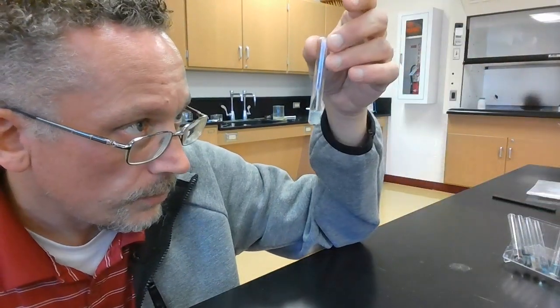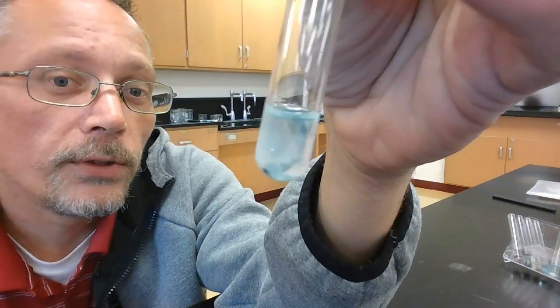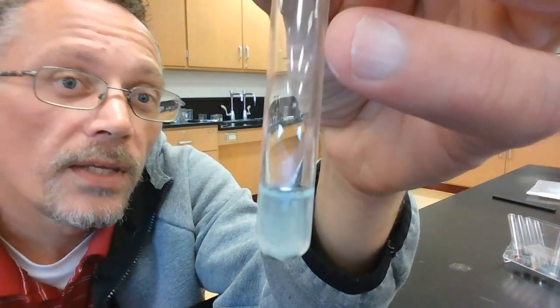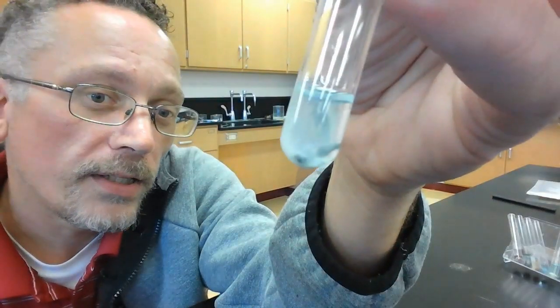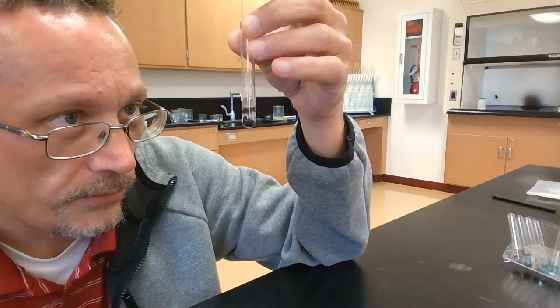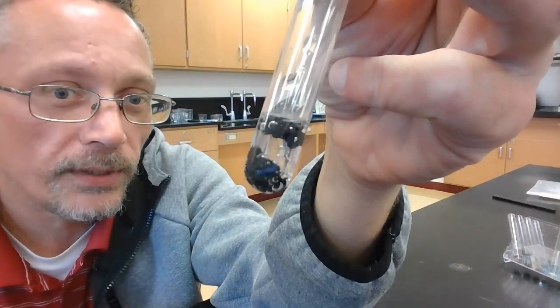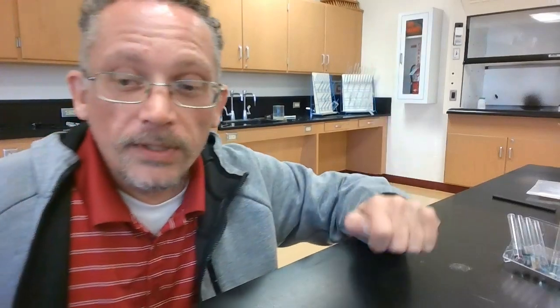But now this one was the tin, and you can see something's happened. Some blue has gone out of the liquid. There's still a little blue in there, but it's a lot less blue. And you can see some cloudy stuff on the bottom by the tin. So something's happened there. And then the zinc had just reacted really quickly at the beginning. So there's no more blue in the liquid, and the zinc's turned black. So some fun things you could see with those reactions after leaving them there for a while.